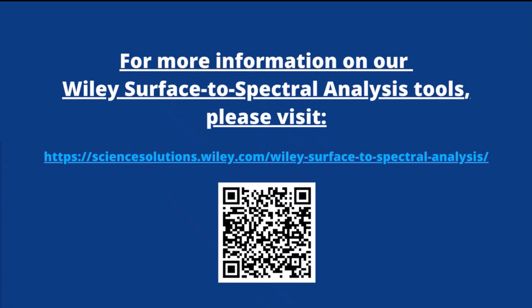So software and help pages are English, French, German, Japanese. The software, in addition to those 4 languages, is also in Spanish, Italian, Chinese, Korean, Brazilian Portuguese, Polish, and Russian. Wow, that is a great variety for folks to be able to utilize. Okay, let's see what else we have.